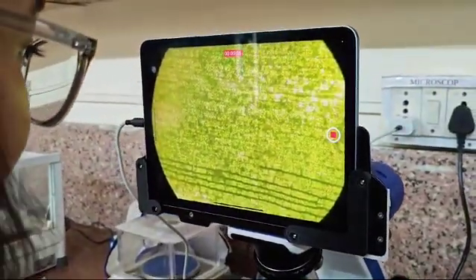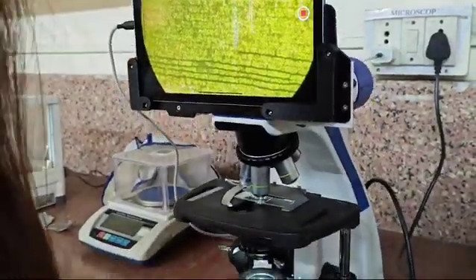We will observe cytoplasmic streaming under 40x magnification. Under 40x magnification, you can clearly see how beautifully chloroplasts are moving within the cell in a circular or rotational motion. This is the cytoplasmic streaming in hydrilla.